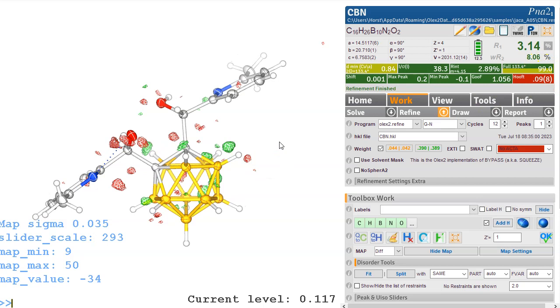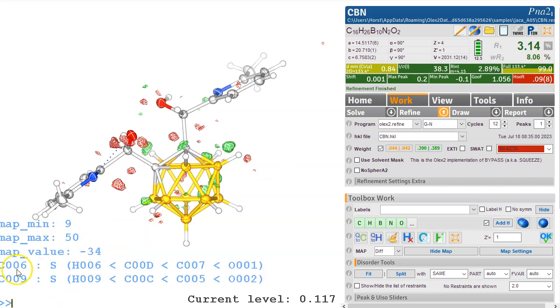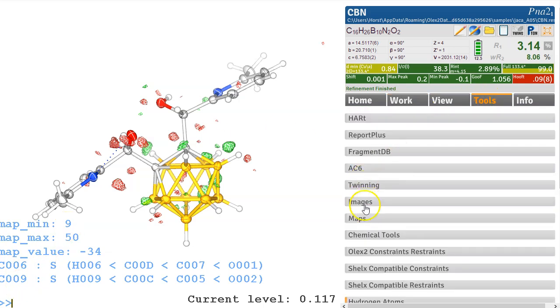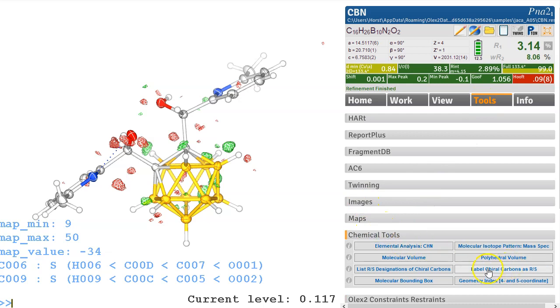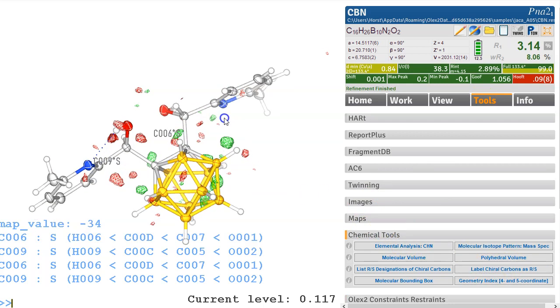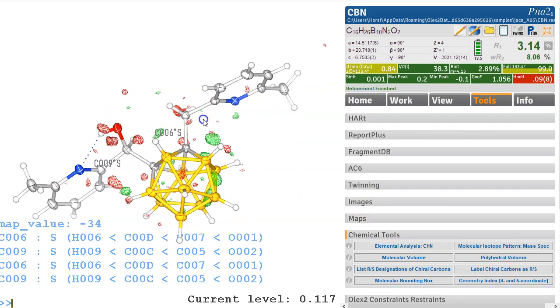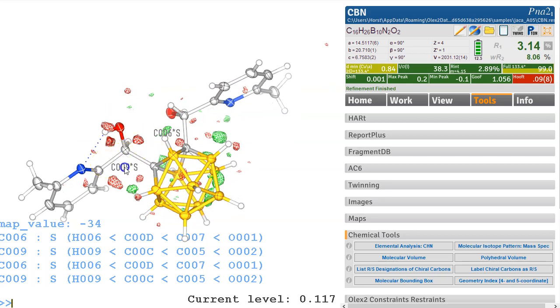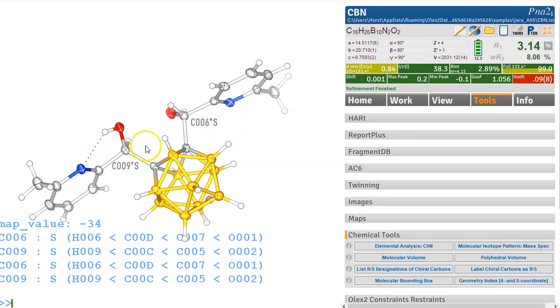So RSA will tell you the chiral atoms are C6 and C09. If you want to know where they are, you can head over to Tools and Chemical Tools, label chiral atoms. So if you put this on, then you see the chiral atoms are labeled. So it's this one here, shift on the left mouse allows you to remove these labels, and this one here. Ctrl M to get rid of them. So these are the chiral atoms and both S.